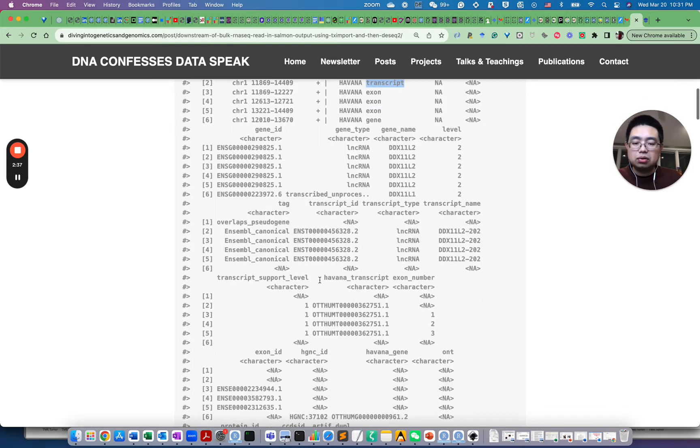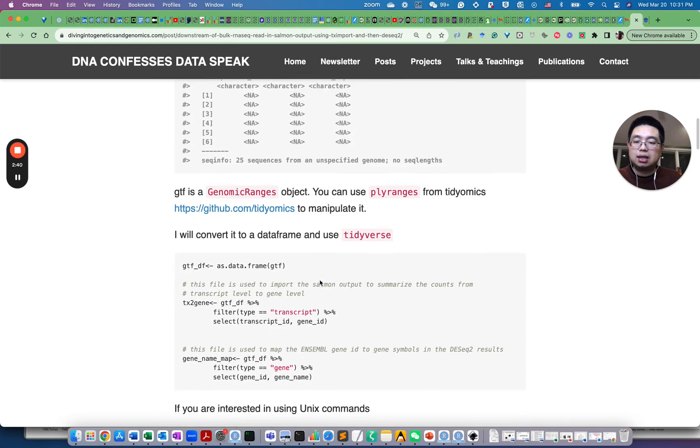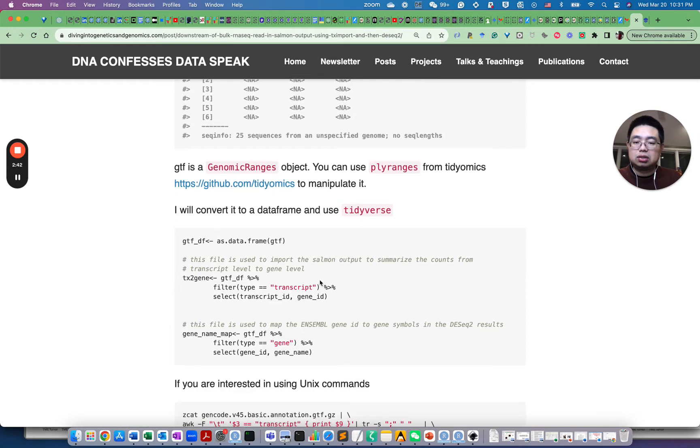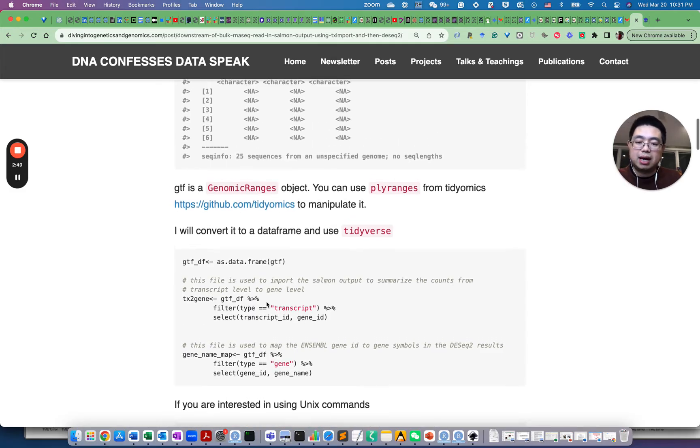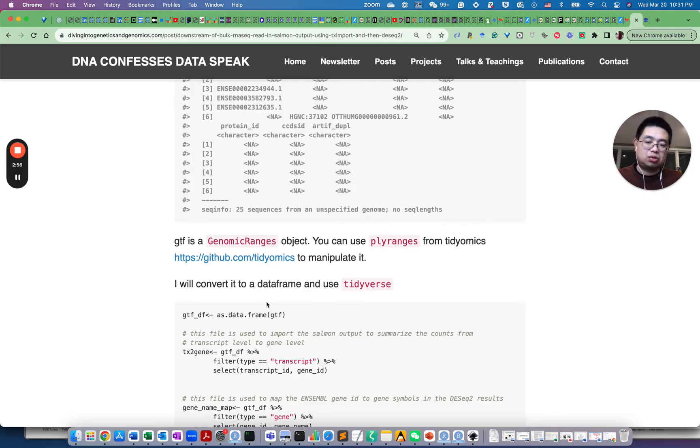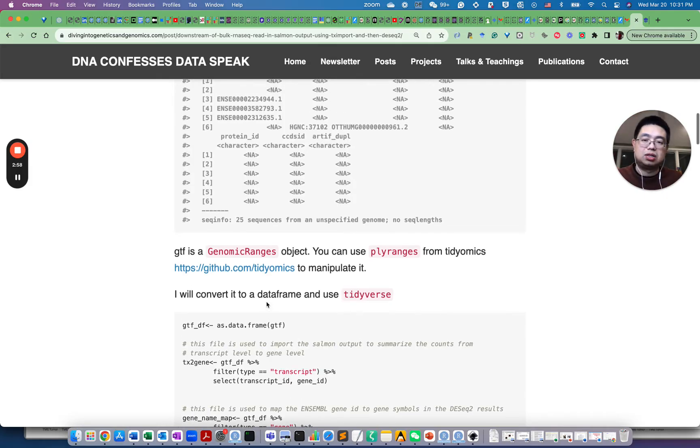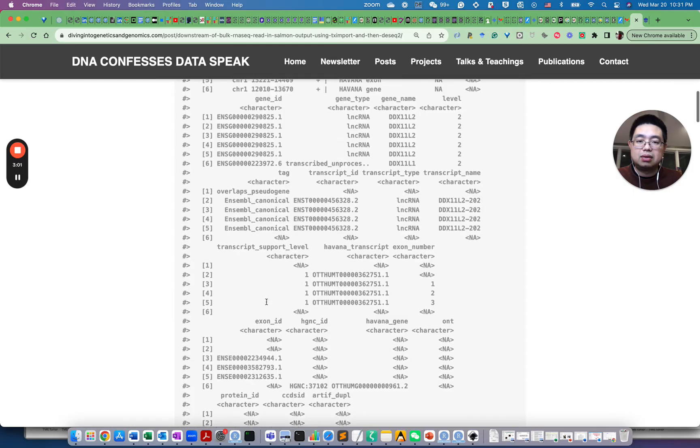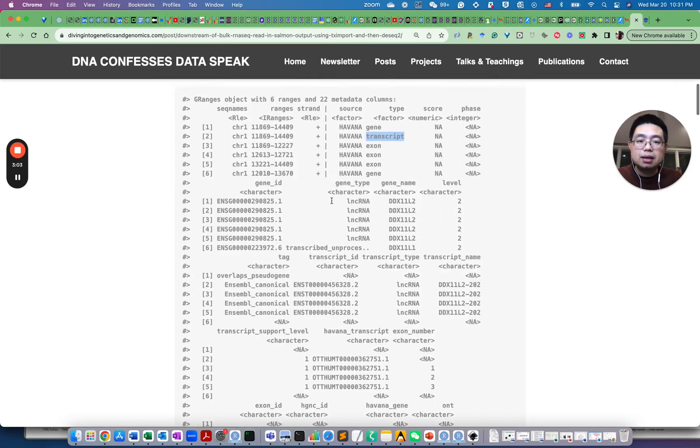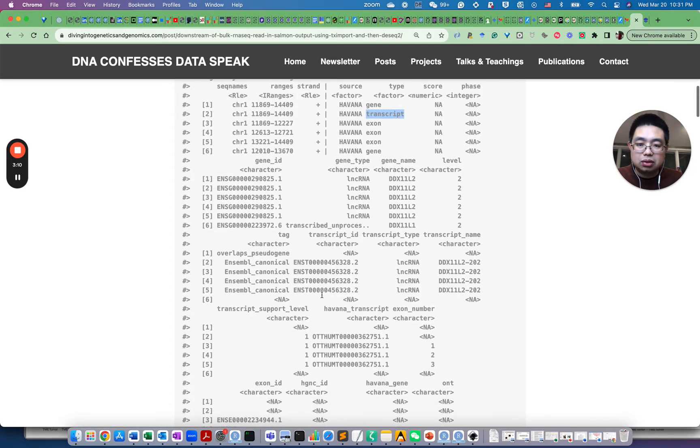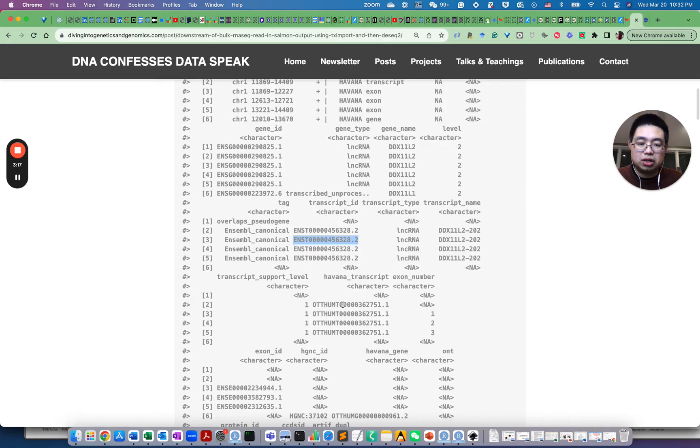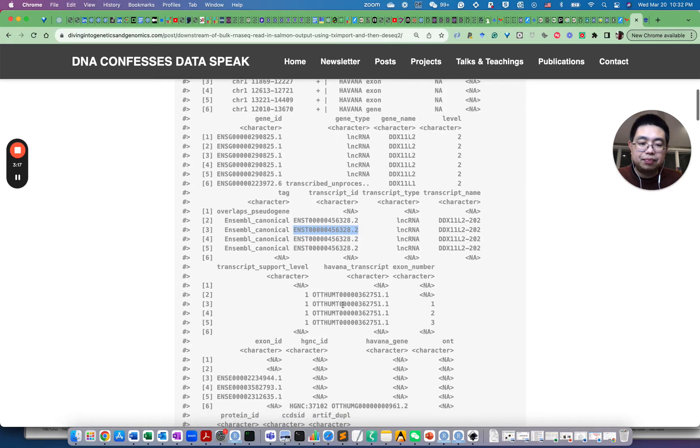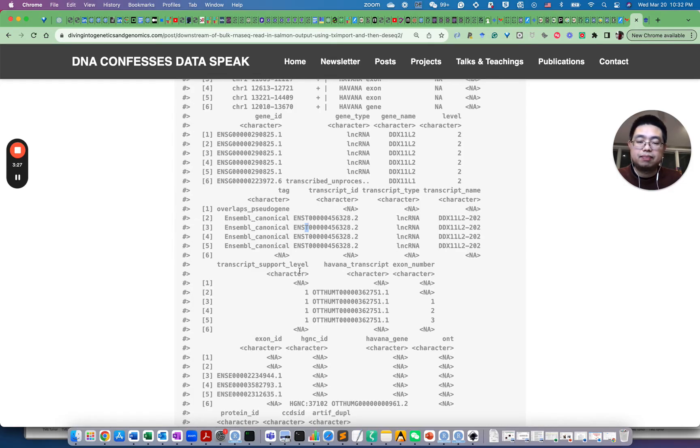It could be a gene or a transcript. For us, we need to actually filter them by transcript. Let's select the transcript ID and gene ID. Now, the TX to gene file needs two columns. The first column is the transcript ID and the second column is the gene ID. If you go up here and you will see, if you select type equals transcript, then you go to here, this is the transcript ID and then you also have the gene ID. It's here, so the gene ID is here. So you see ENSG, this gene ENST, so those are transcripts.